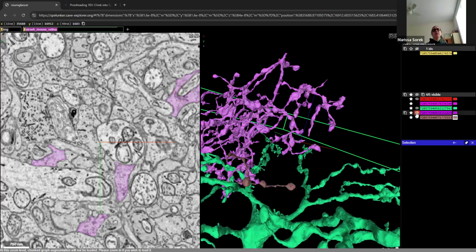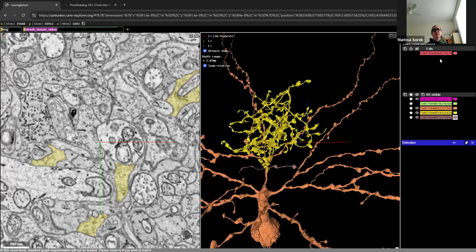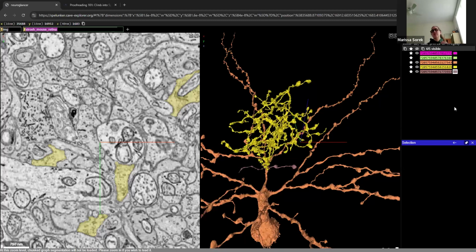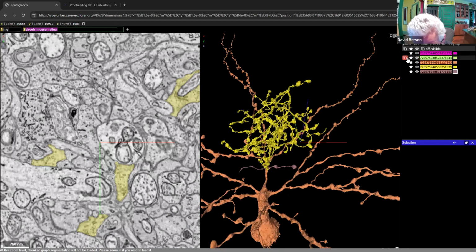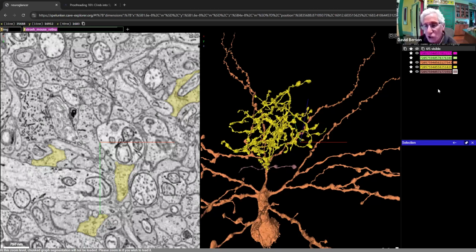All right. So for what we're looking at here, we've selected a whole bunch of different cells. I still have this search list from that initial segment ID I pasted in up here. If I ever want to get rid of this search list and only have my active list, all I need to do is remove the search term from the search list, and I'm back to only having that one active list. Got it.